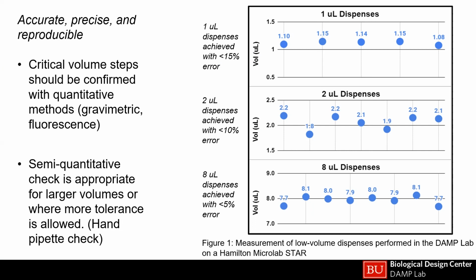And the nice thing you can see is the 1 microliter is consistently wrong. So it's not much variation, but in this particular case, we weren't too concerned with that percent error. So it depends on the process and how much you need it to be optimized.